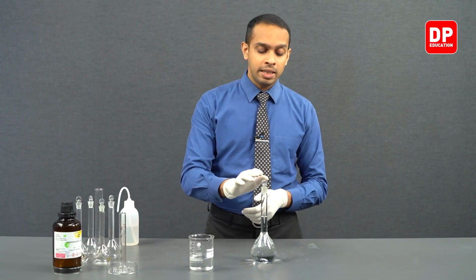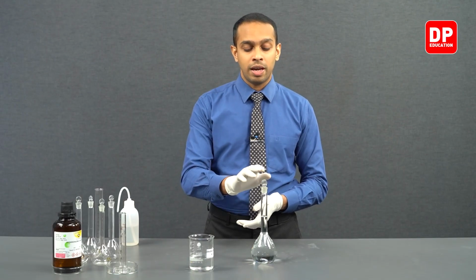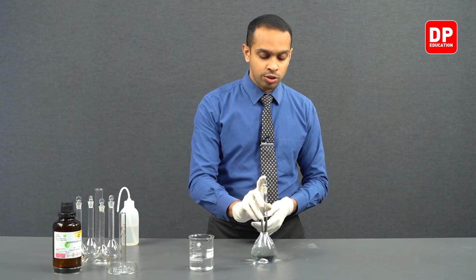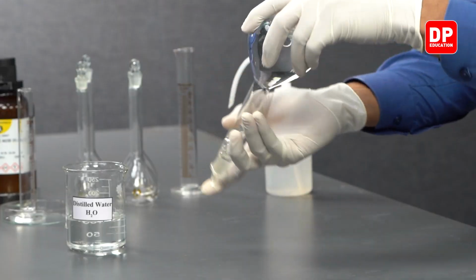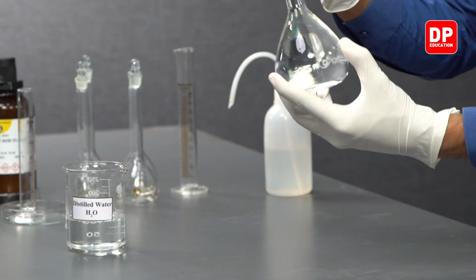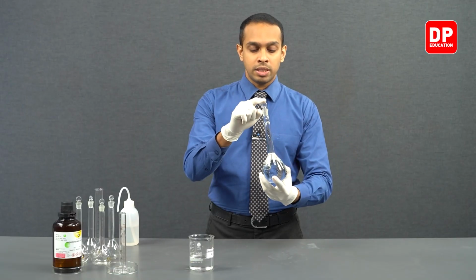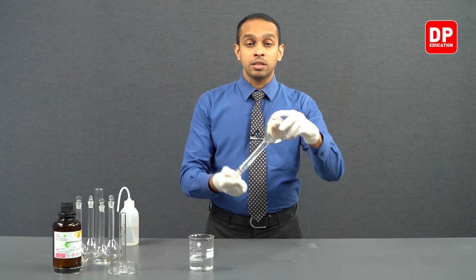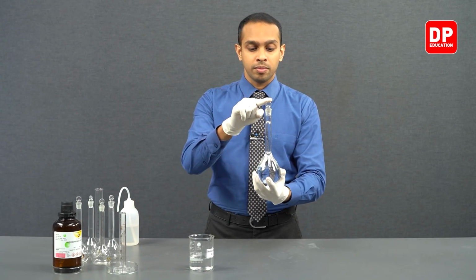So after adding this amount of water, we have placed the stopper here. After placing the stopper, we can turn this volumetric flask upside down a couple of times to mix the solution really well.